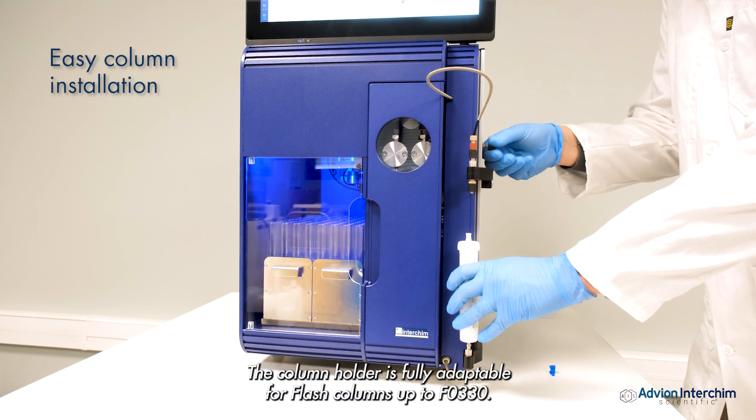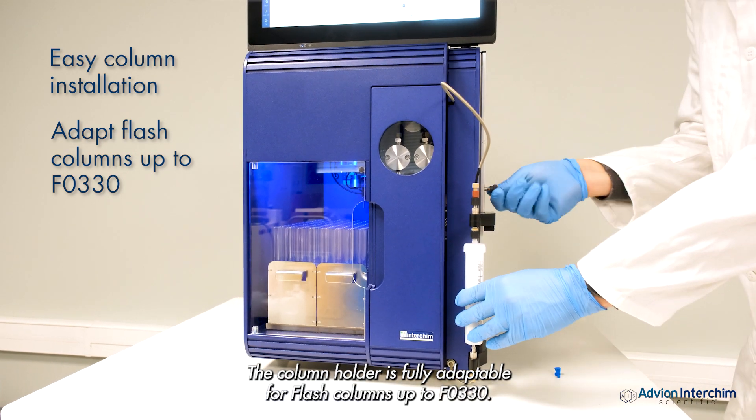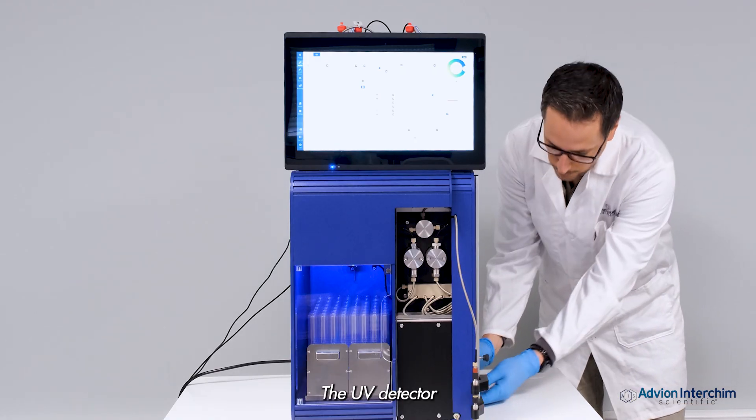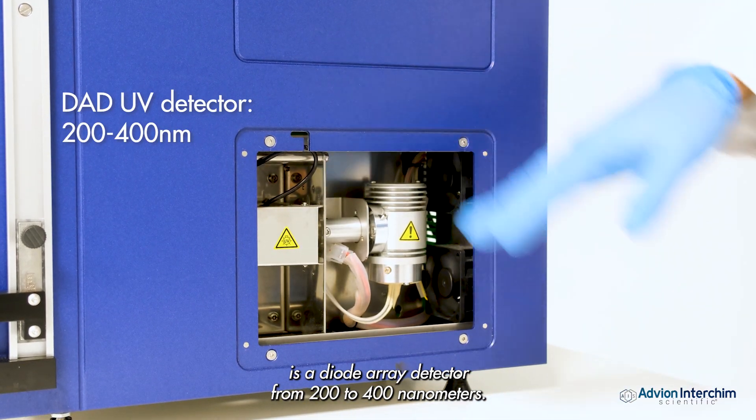The column holder is fully adaptable for flash columns up to 330 grams. The UV detector is a diode array detector from 200 to 400 nanometers.